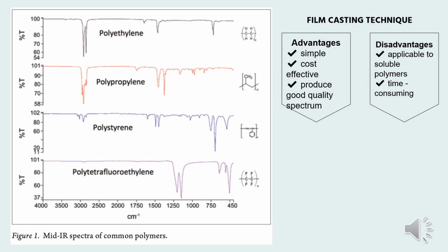However, differences can be seen between the two because there are differing ratios of CH2 and CH3 groups. The bottom one, which is the PTFE, has no CH stretch at all because there are no CH groups present in the polymer. So the very weak bands present must be due to impurities or maybe surface contamination.